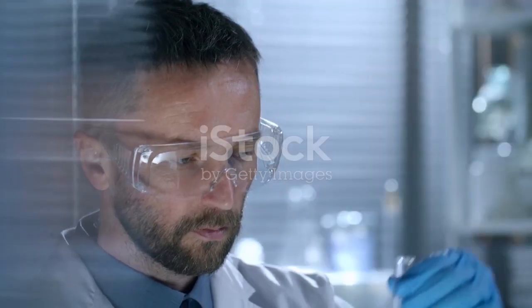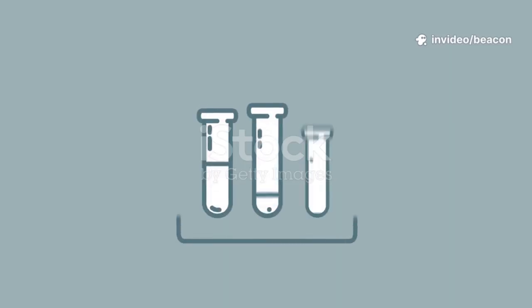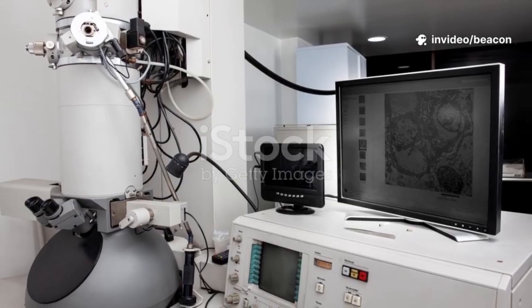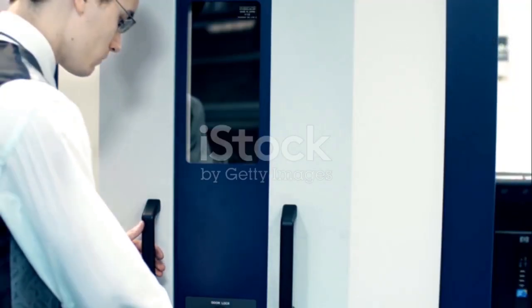So, how do scientists characterize or study nanoparticles? There are a few key ways. Electron microscopes give us super detailed images, letting us see their shape and size. X-ray diffraction reveals how their atoms stack up, kind of like peeking at the blueprint of a building. And dynamic light scattering? That helps us measure how they move around in liquids.